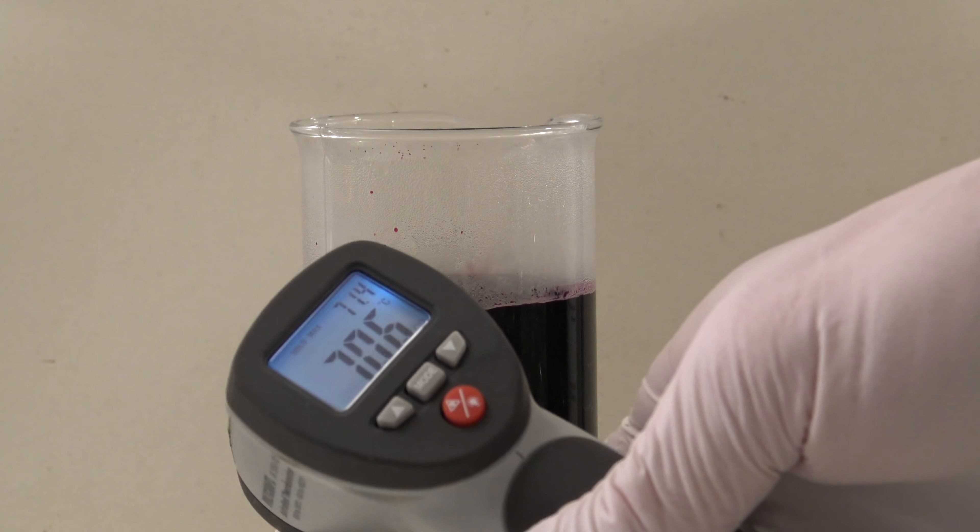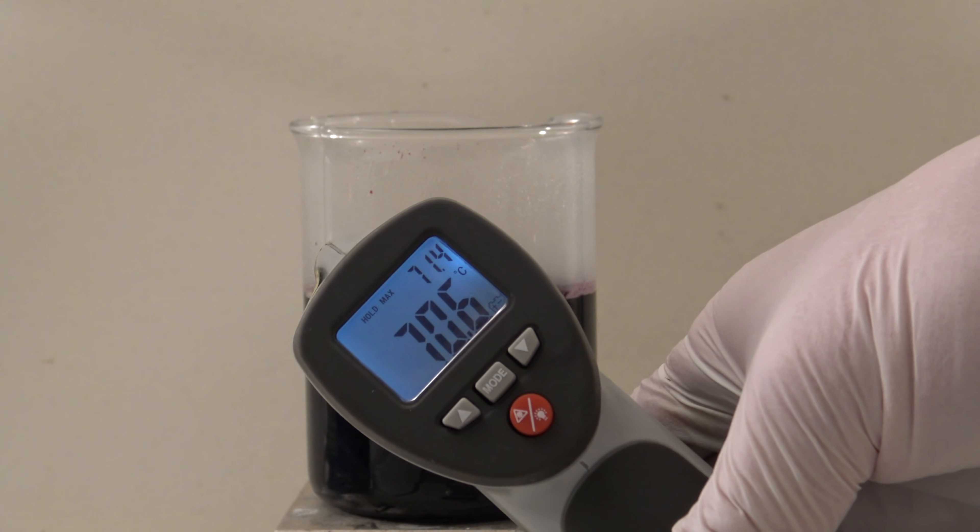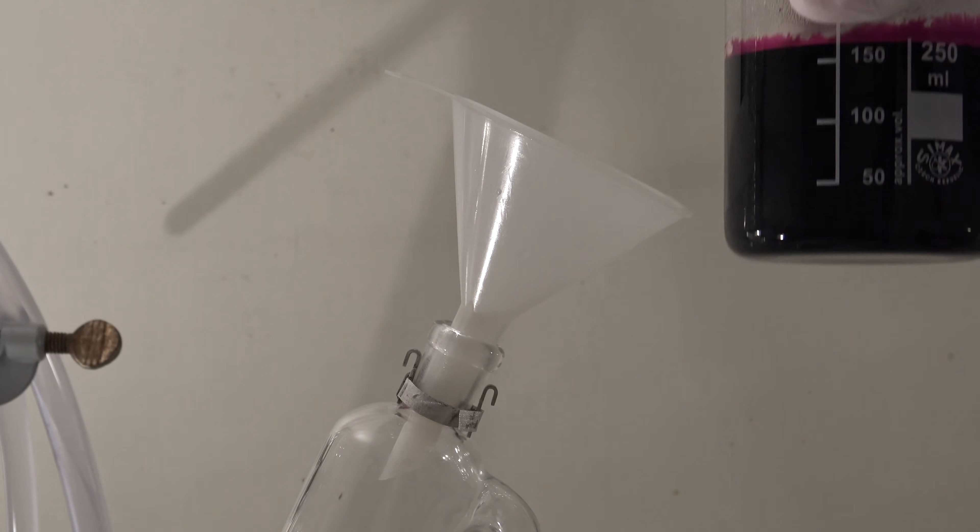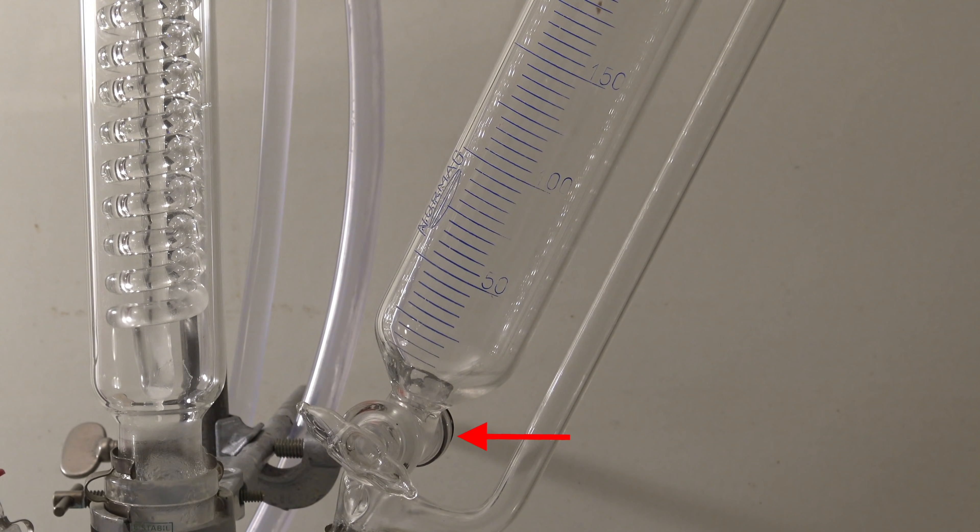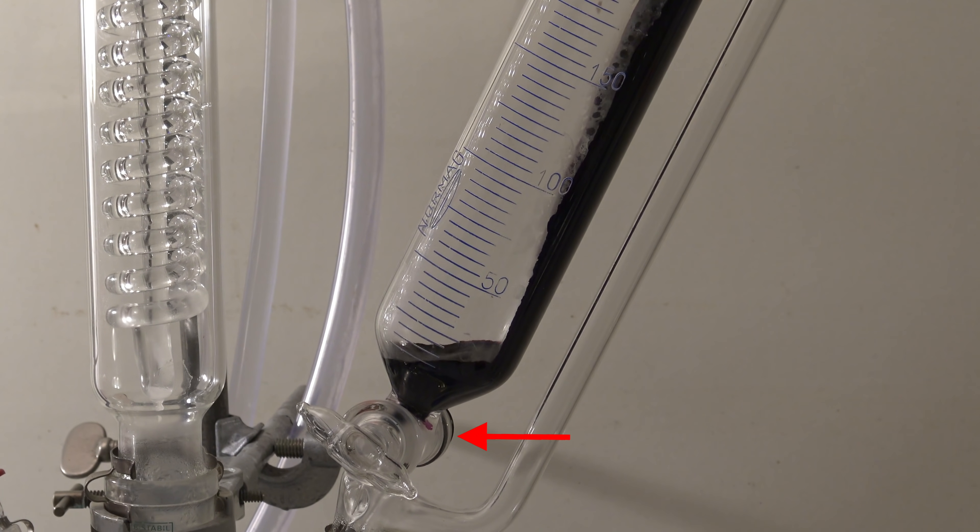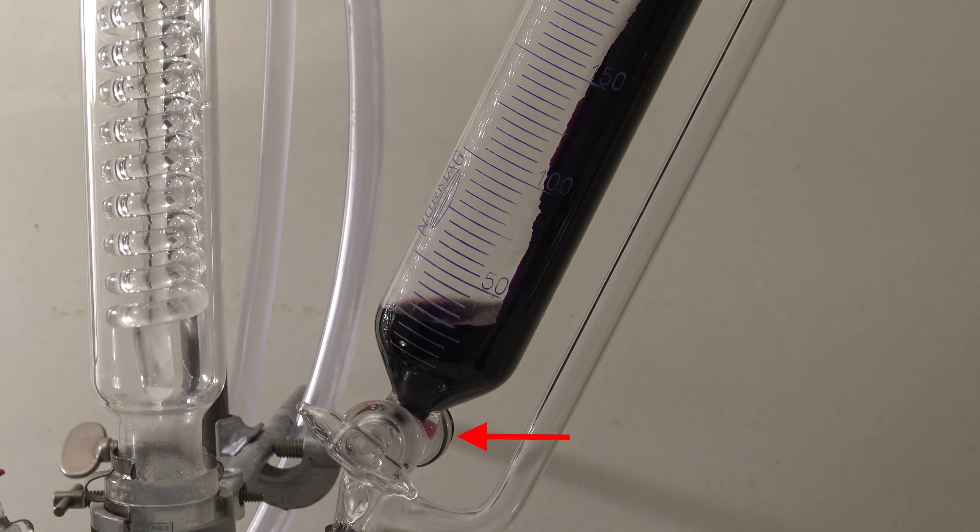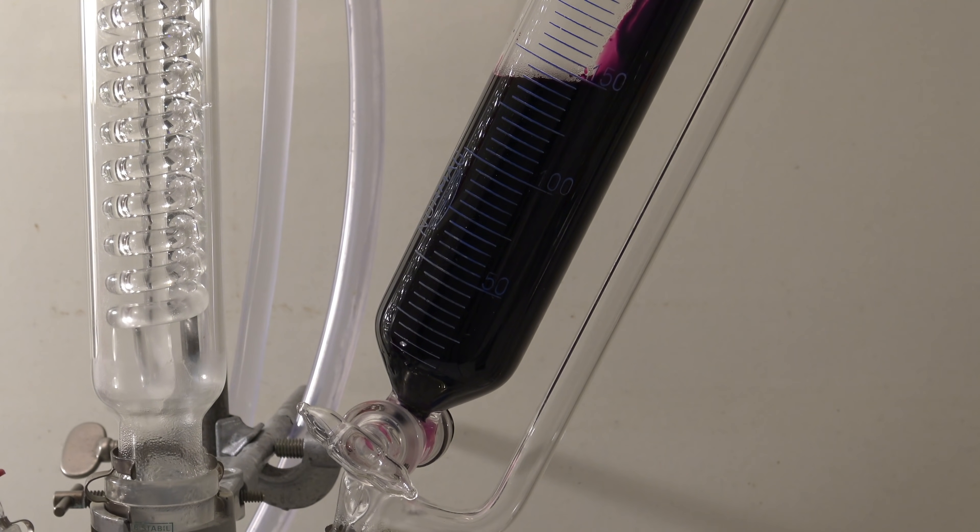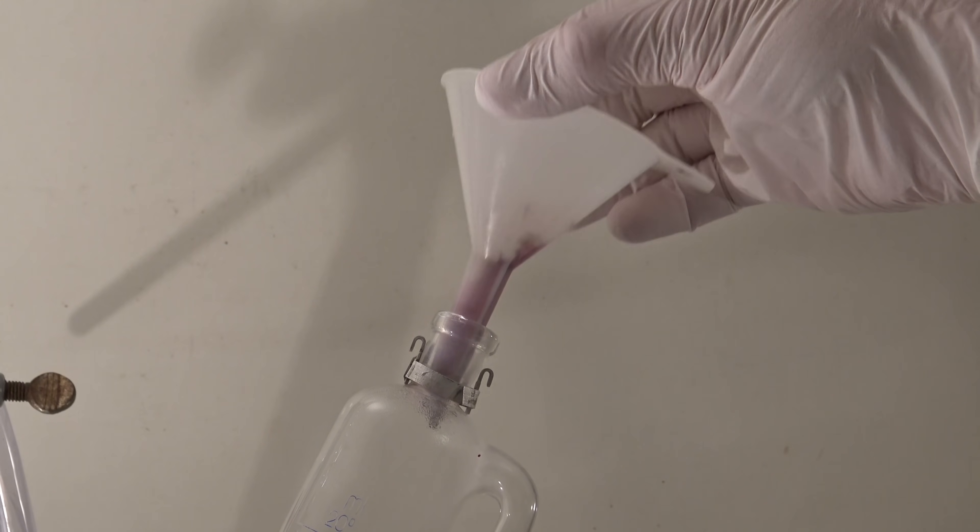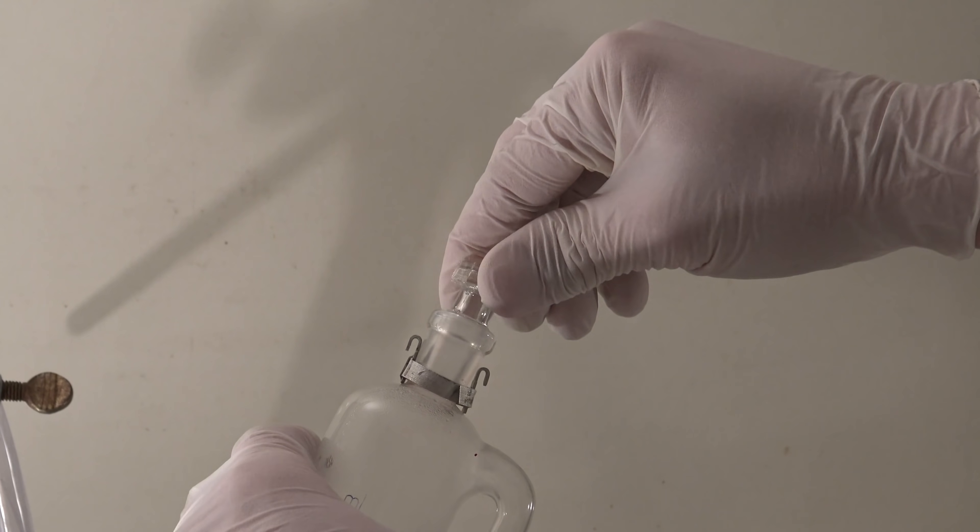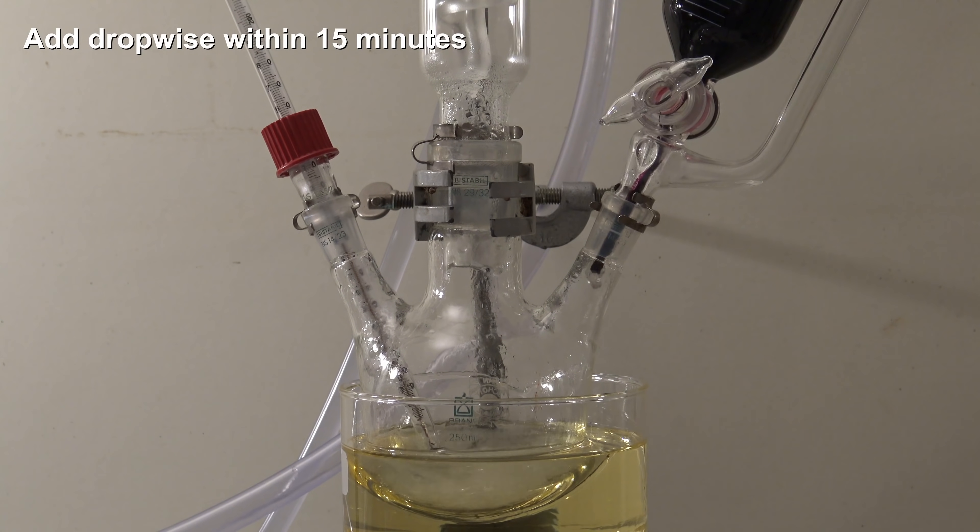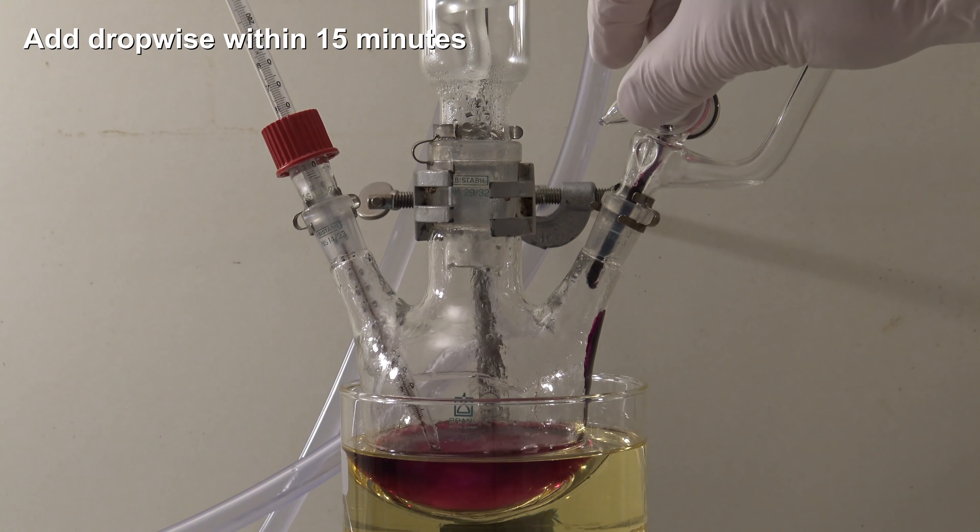When both solutions had reached their temperature, the permanganate solution was added to the dripping funnel. It could be seen that the stopcork was not sealing properly, but this was not a problem. Then the solution was added dropwise to the boiling mixture within 15 minutes.